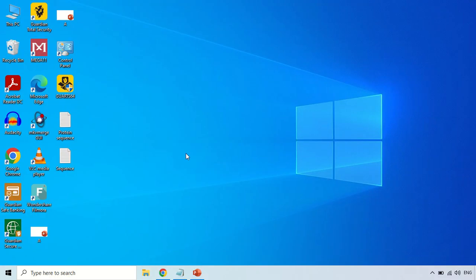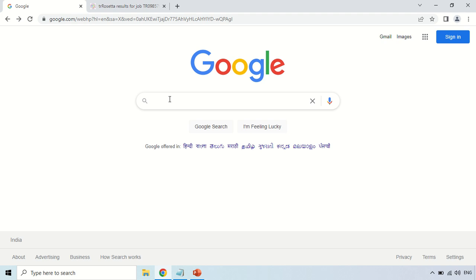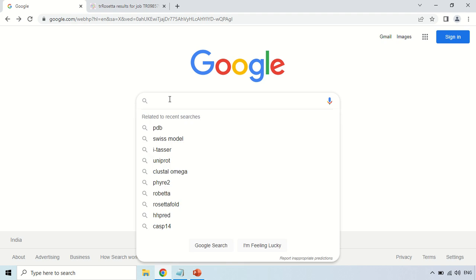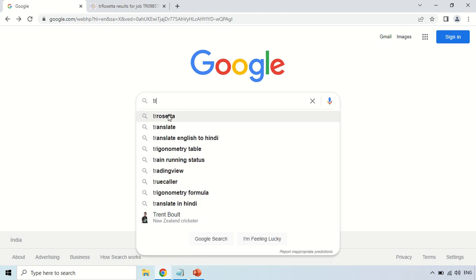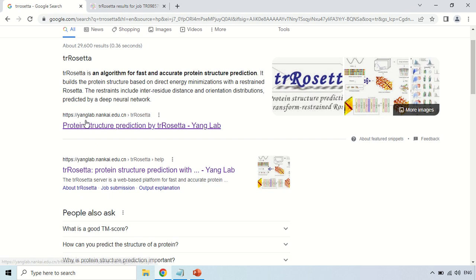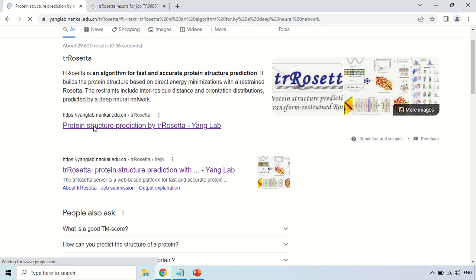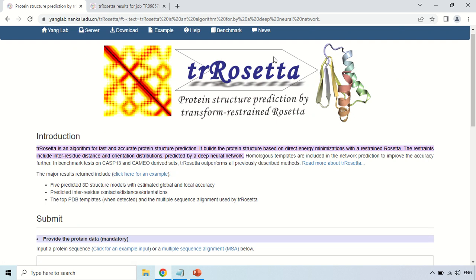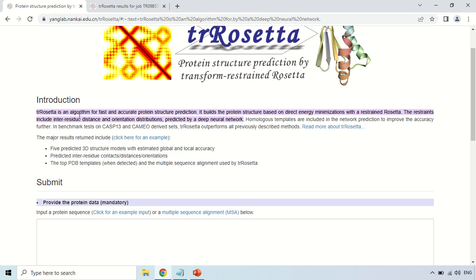In order to open TR Rosetta, just open your browser and search for the software TR Rosetta. Click on the first result, which is the main website. As you click, this is the home page of TR Rosetta. Here you can find the introduction about TR Rosetta and how its algorithm works.